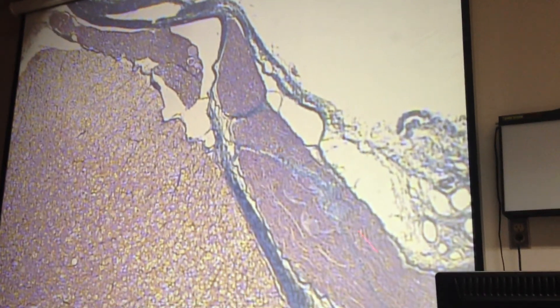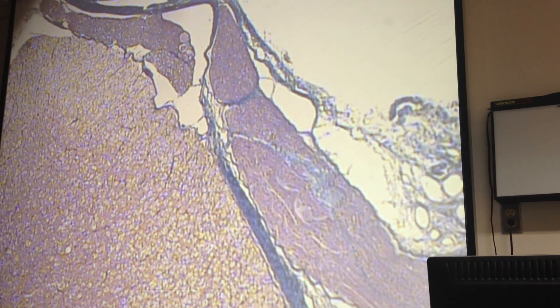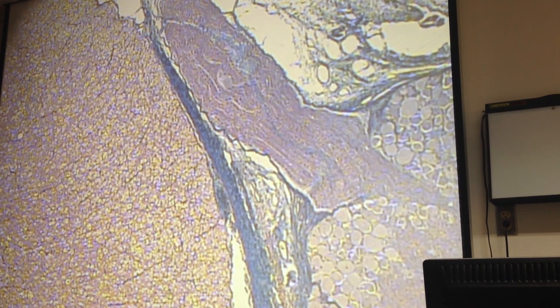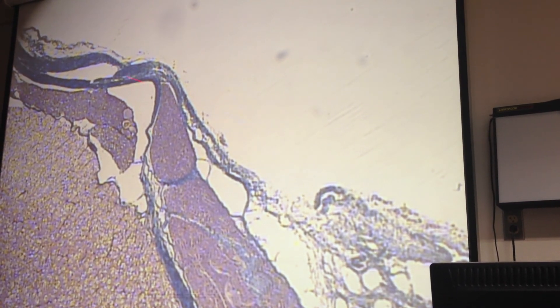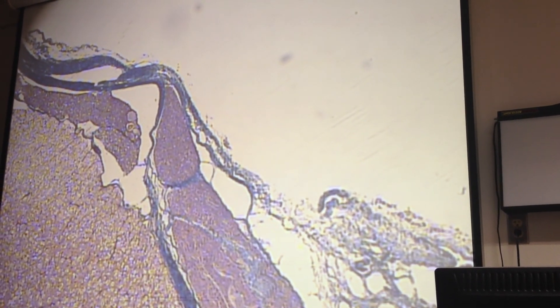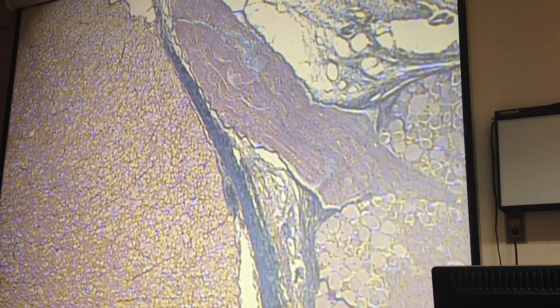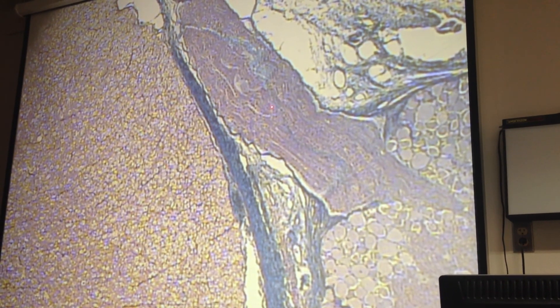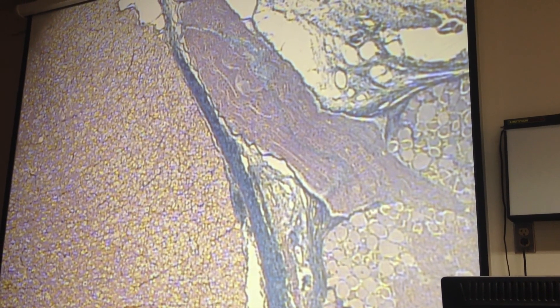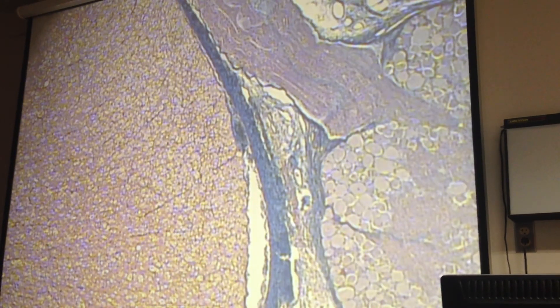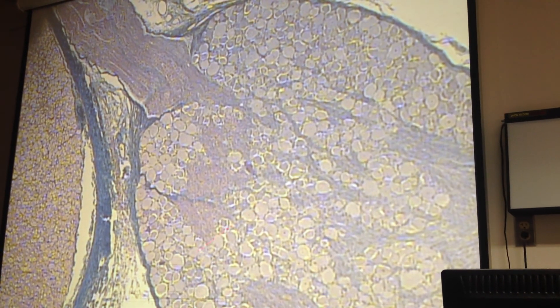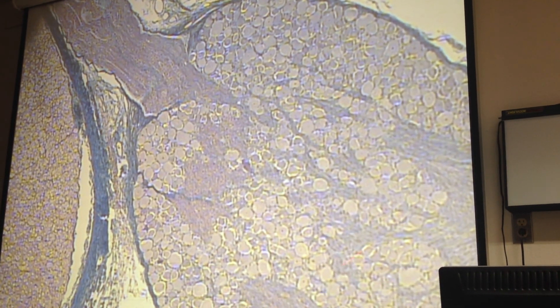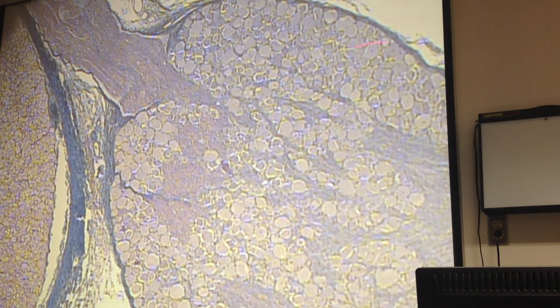The connection is a little messy right there, a little bit breaking off, but here you can see, what is that nerve? Somebody said it. This nerve right here. Dorsal root. That's the dorsal root. So this is what? What's this whole structure? Ganglion. Ganglion, yeah, dorsal root ganglion. That's the dorsal root ganglion.